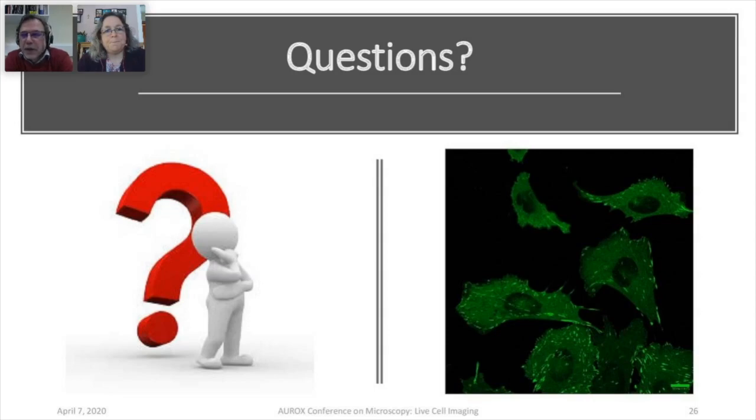I guess also it depends on how user-friendly that is made by the manufacturers, because with point scanning confocal it's very easy to overindulge. If you're short of signal to noise, you just ramp up laser power. Sure. And I think that's often the first response when an image is dim, to put the laser power up. We would advocate for line averaging, and slowing down. Again, it depends on the biological process you're trying to measure.